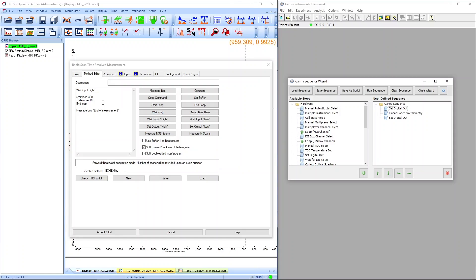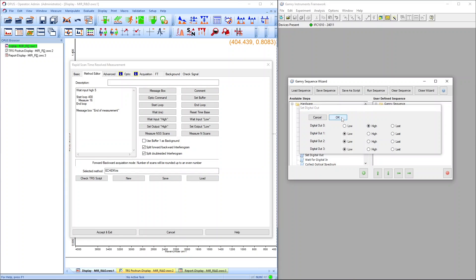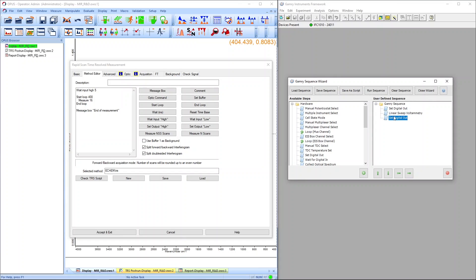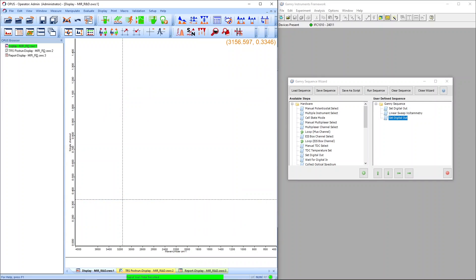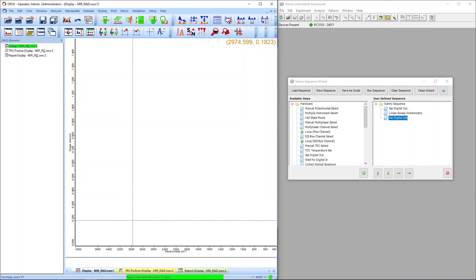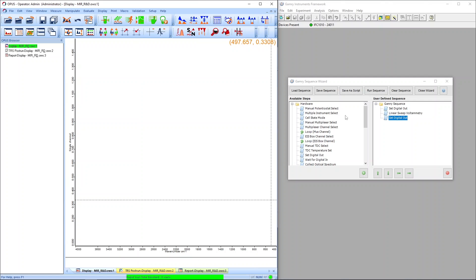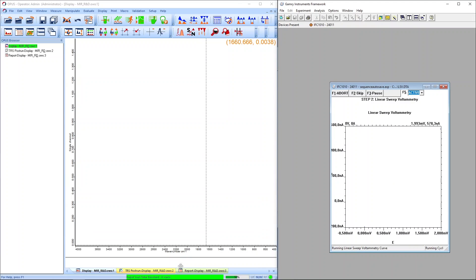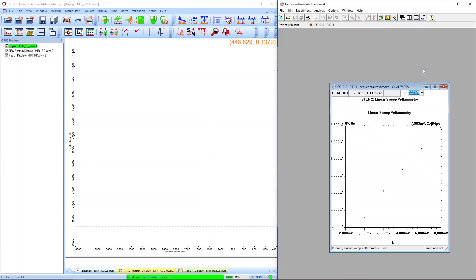On the left, you can see the OPUS time-resolved editor where an FTIR run is prepared. The system waits for a trigger signal from the potentiostat and starts afterwards a loop of 400 spectra. This method is stored in an OPUS TRS file. On the right side, you can see the GAMRI sequence wizard, where an output trigger is generated followed by a linear sweep voltammetry run, increasing the voltage from 0 to 0.8 V with a scan rate of 2 mV per second. At the end, the output trigger returns to its original value. As soon as the FTIR method is started, it waits for the trigger signal coming from the potentiostat, and you can see how the FTIR measurement proceeds as soon as the linear sweep voltammetry run is started. Both the FTIR acquisition and the linear sweep voltammetry are then running in parallel.